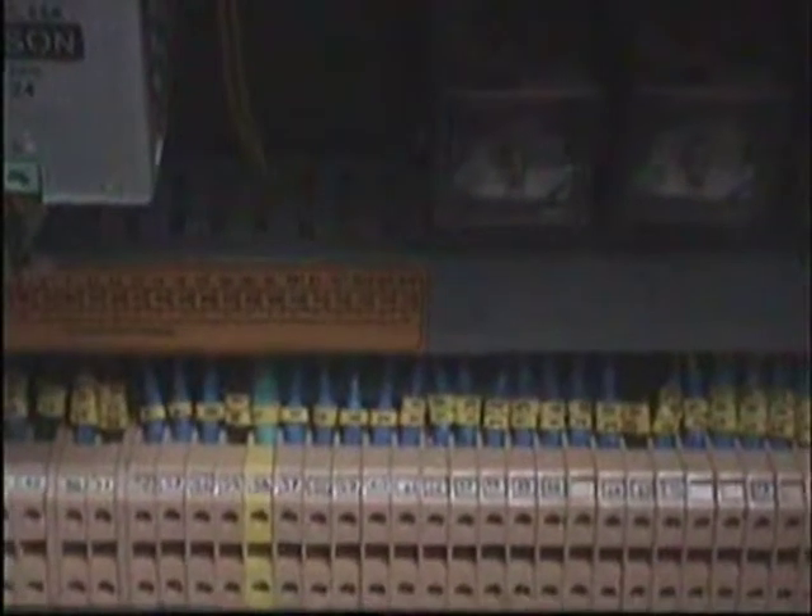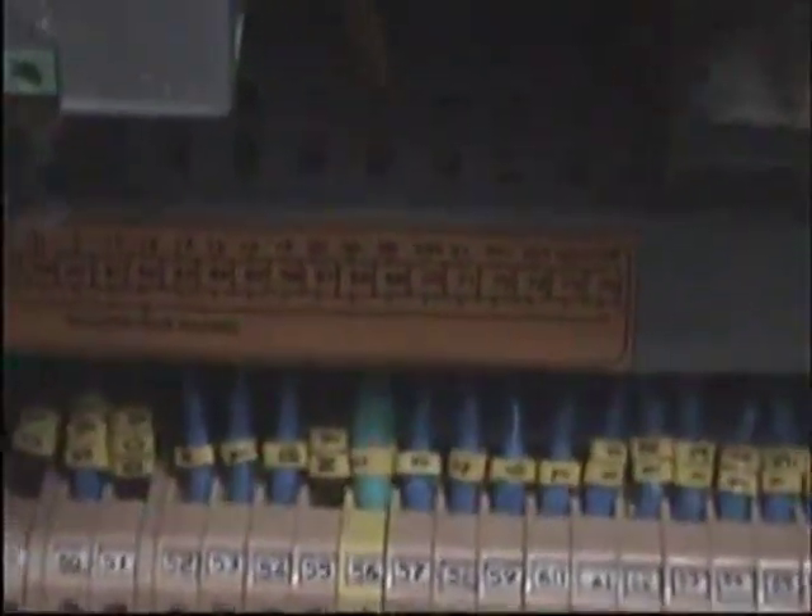This is the box where the two vacuum pumps are housed. This is the control panel housed on the back of the machine. All the wires you are seeing are properly numbered and everything is serially labeled, so that any electrician can do the maintenance at your site.